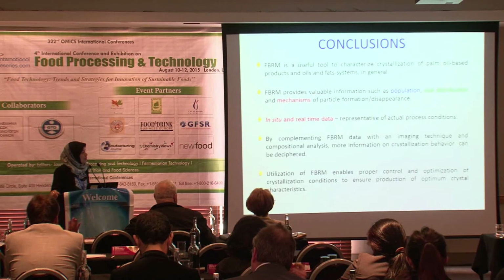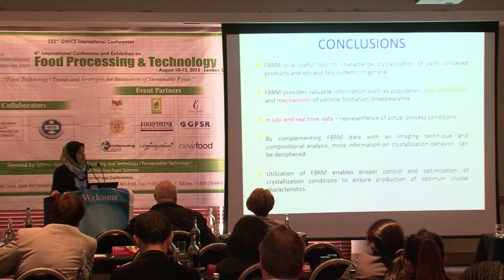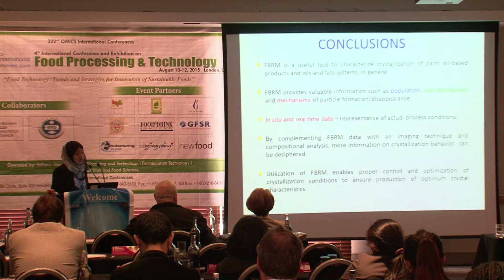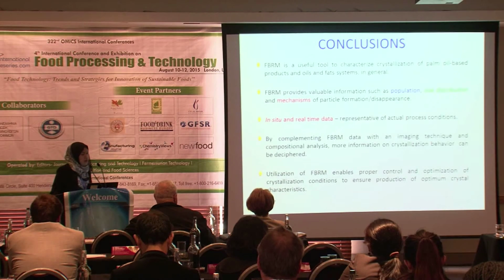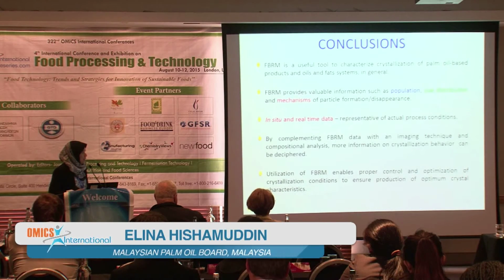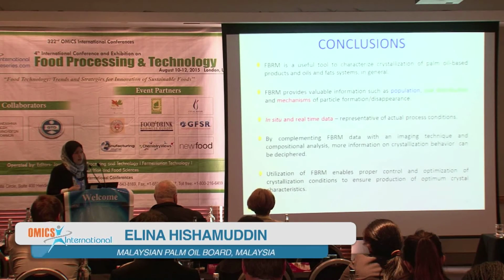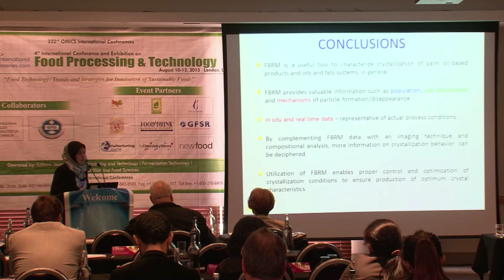I just wanted to conclude my presentation that we found that FBRM is a useful tool for monitoring in situ and in real time the crystallization of palm oil-based products and oils and fat systems in general. And we've been able to obtain valuable information such as the crystal population, size distribution, and also the different mechanisms that occur throughout the crystallization process. The advantage of using this technique is that the data is obtained in situ in real time, so it's closely representative of the actual process conditions.